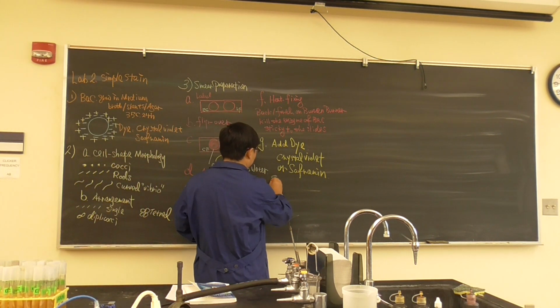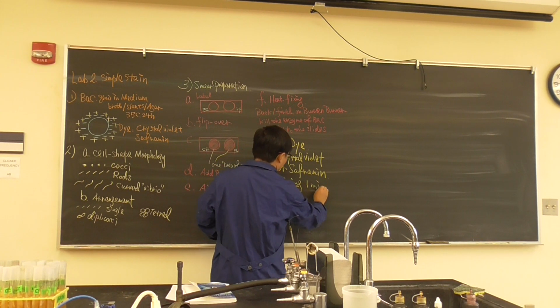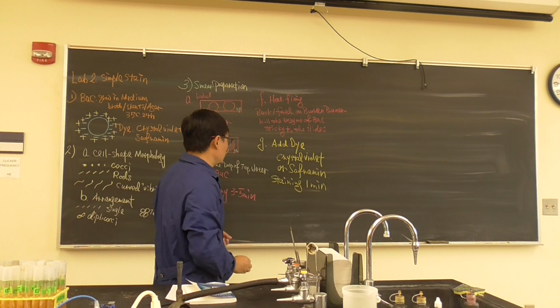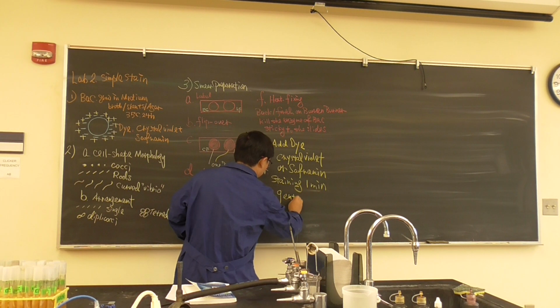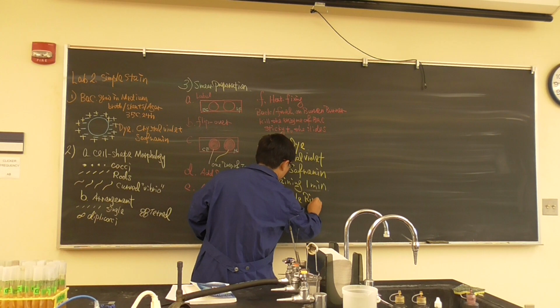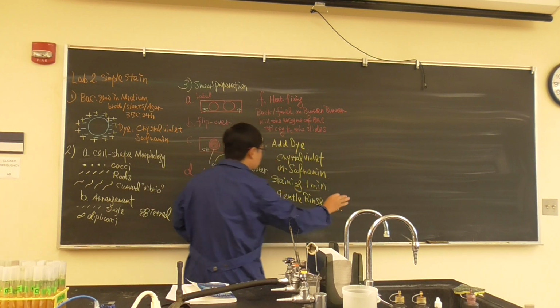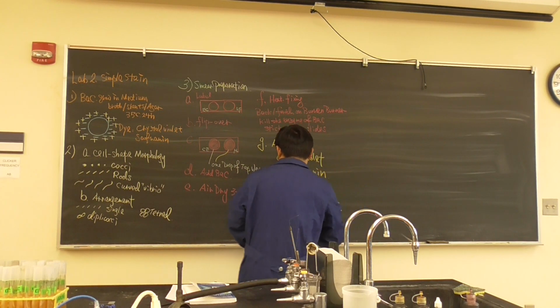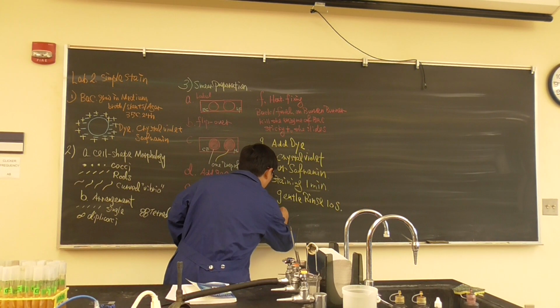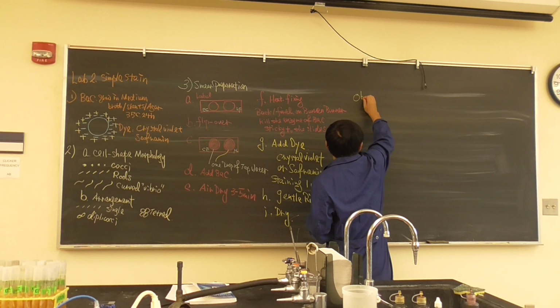Then staining, 1 minute. After you stain 1 minute, we'll do the gentle rinse for like 10 seconds. We just rinse it, and then we dry it. The last step will be dry. Okay, now it's ready to go. So these are slides. Well, we'll do the observation.